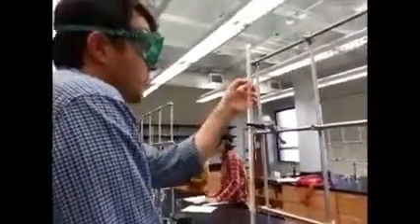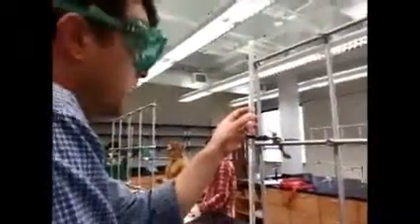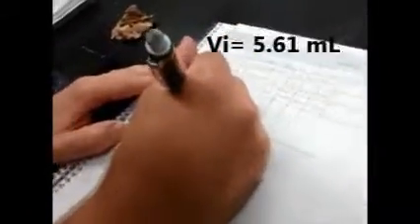Before filling the burette, we will need to prime it. This is done by filling the burette with a few milliliters of the standard solution and rolling it over a few times, and then rinsing it out. Repeat this process a few times before actually filling the burette with the standard solution. Initial reading is going to be 5.61 milliliters. Initial volume is 5.61 milliliters.